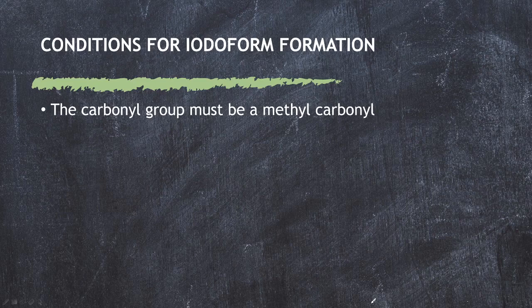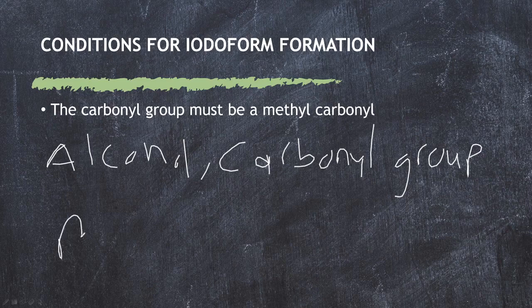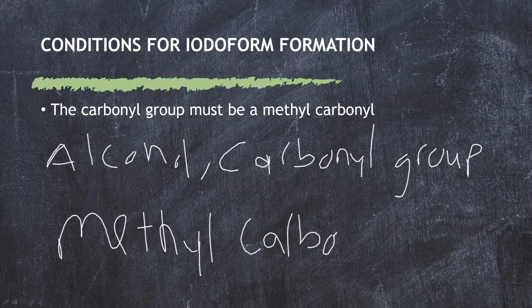Like I said, this test is used to test for the presence of an alcohol and a carbonyl group. I'm trying to streamline it again because not all carbonyl groups undergo this test. The carbonyl group or the alcohol that will undergo this test must be a methyl carbonyl or alcohol.